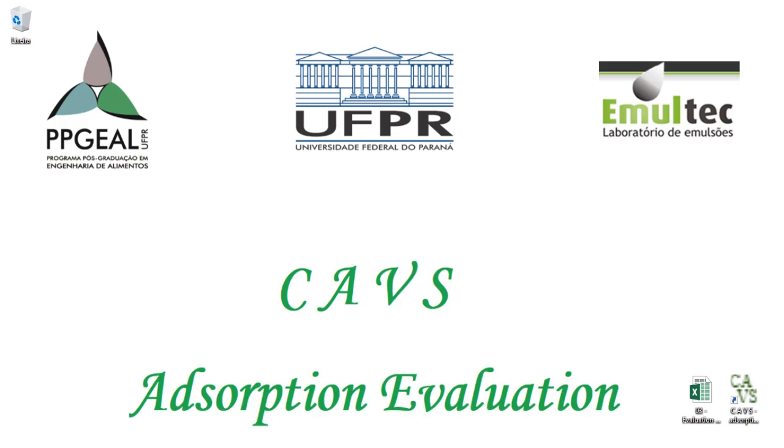Hello everyone, in this tutorial I will show you how to use the menu data with replications for kinetic data. This module was developed to verify if the experimental data reached a constant behavior based on comparison tests. Initially, it is necessary to prepare the sheet with the data.